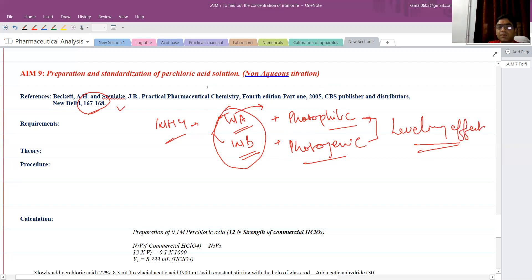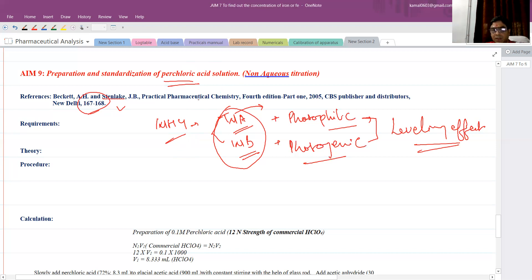Here we have to take the perchloric acid solution. It is one of the strongest acids used in non-aqueous titration — it is stronger than hydrochloric acid itself. We will use this perchloric acid for the titration of weakly basic drugs.